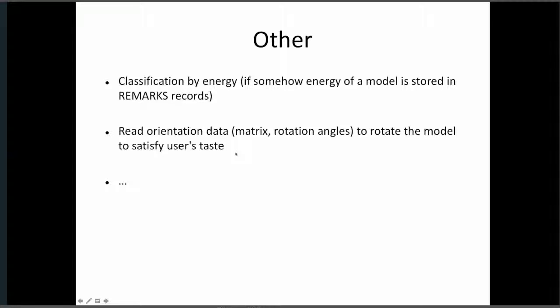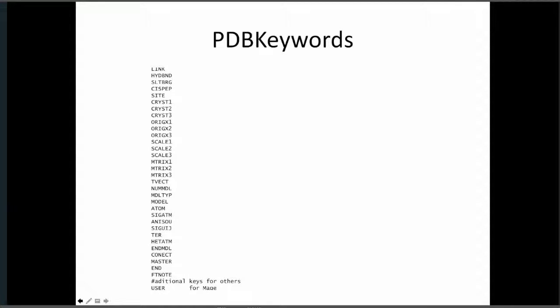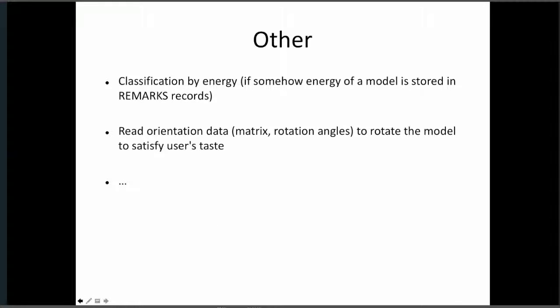Another feature that a friend, James Arabini, asked me about: once he is done doing some orientation, he states the nice orientation he wants the coordinates to have. He was able to do that with Mobile. So he wanted the software to read the transformation matrix and apply it to all the coordinates.